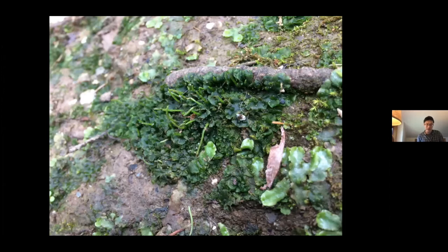About cleanliness. If you're interested in hornworts like we do, you find a big patch of hornworts, peel it off, get the DNA and sequence it, you will get really horrible results. You will have nematodes, algae, fungi, bacteria, other mosses.